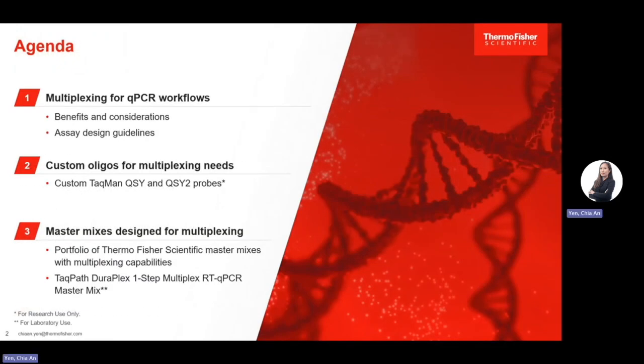In today's webinar, we'll start with a general explanation of what multiplexing means in qPCR, followed by why one might consider using multiplexing in qPCR. Then we'll go into the key factors that influence the success of multiplexing in qPCR.